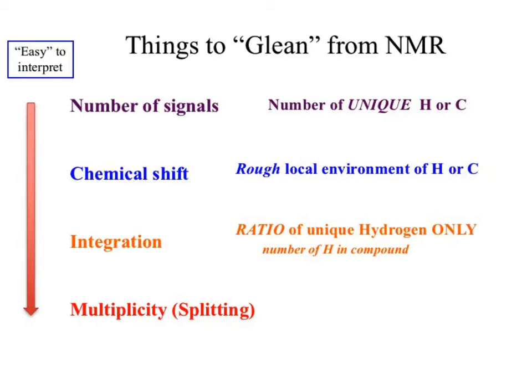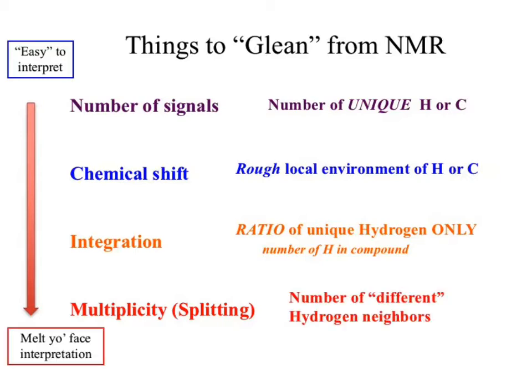I oscillate back and forth between those terms. I'm trying to stick to multiplicity because it's less confusing. This gives us information about how many magnets are near it. Okay? So that gives us an idea of the neighbors. Almost everybody jumps into the neighbors because when you watch somebody solve, that's what they do.